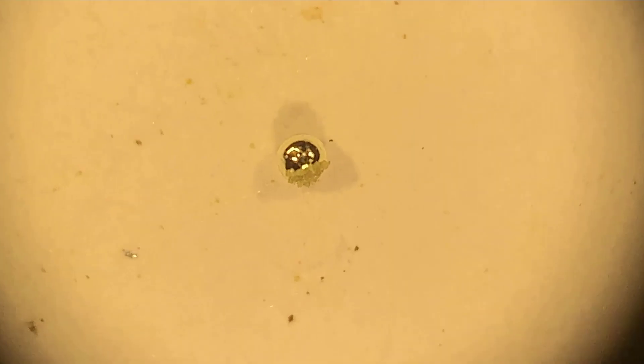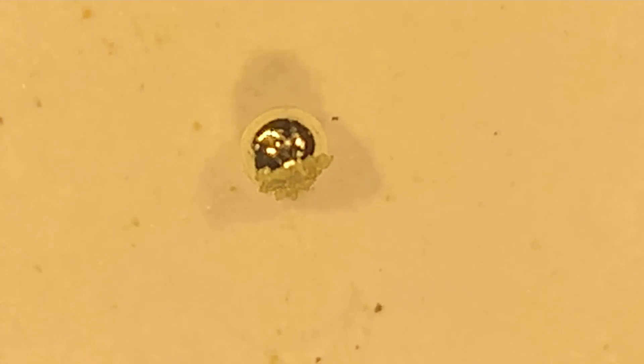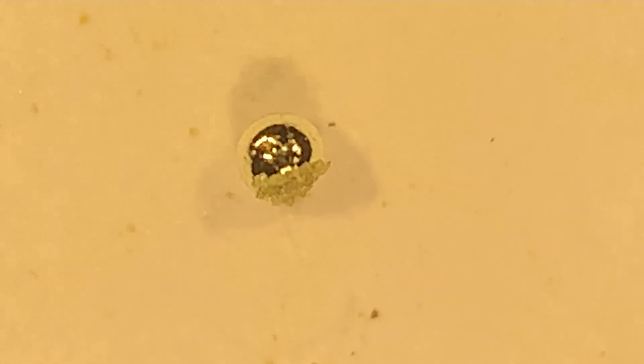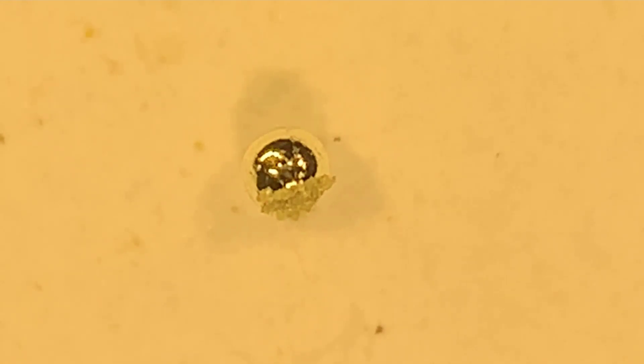There it is — you can see a couple of things. It's a nice golden color. Let me turn on the blue light. Kind of pretty. It's got a bunch of the cupel material stuck on it — magnesia. The way I take care of that is I put it in hydrochloric acid for 10 or 15 minutes, and that'll take it right off.